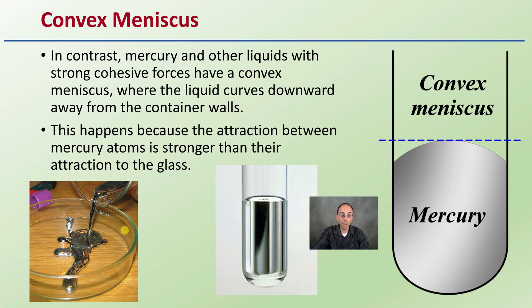This is what mercury looks like. You probably haven't seen it in real life, but it is a metal that acts as a liquid, as you can see here being easily poured. When put into a container, because of its attraction, it's going to actually have the opposite effect as water. So we would read from the apex of that curve — in this case, it would be the top. But you probably will not be working with mercury.